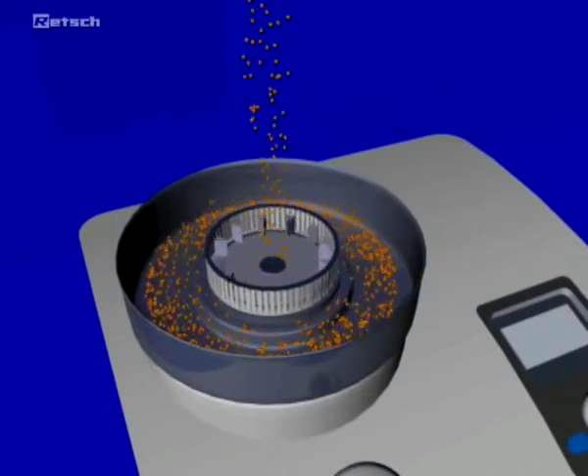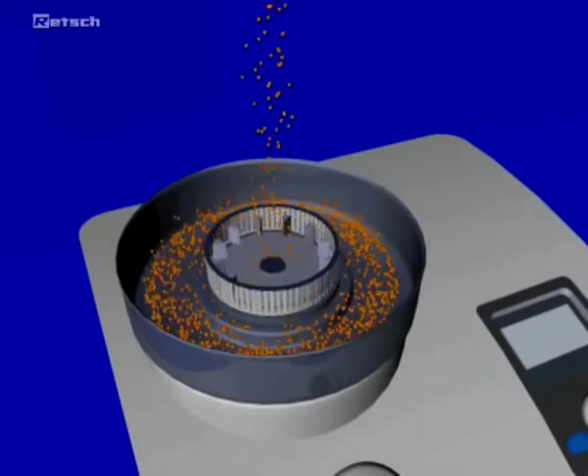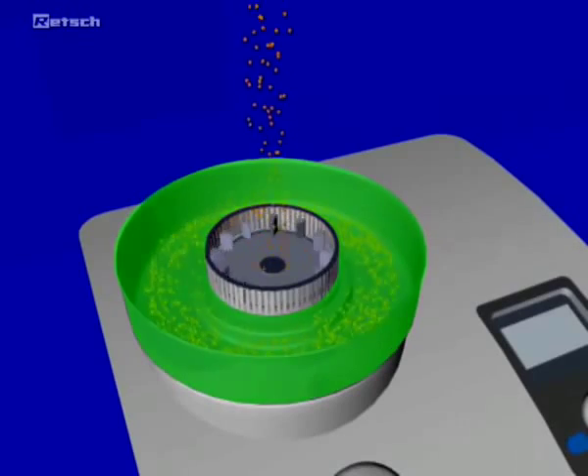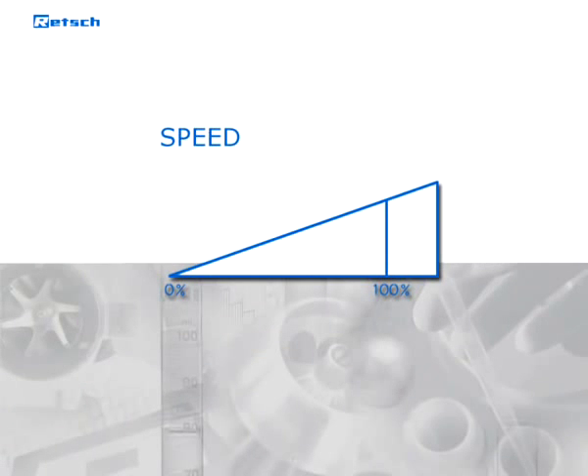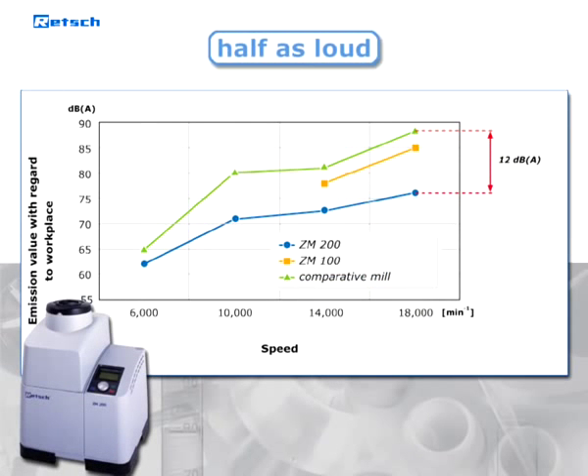The feed material only remains for a short time in the grinding chamber. As soon as it is finer than the mesh size of the sieve used, it is collected in the collecting vessel. Despite the wide speed range between 6,000 and 18,000 revolutions per minute, the mill is surprisingly quiet.